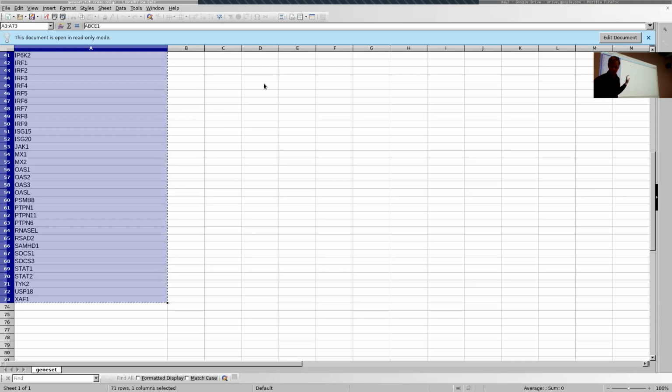in Hallmark in particular, were created for human. So this is one thing to keep in mind when you apply this to other organisms. For mice it's usually kind of similar, but if you have some weird animals or even plants or bacteria, you should find some other database that was curated with this organism in mind.